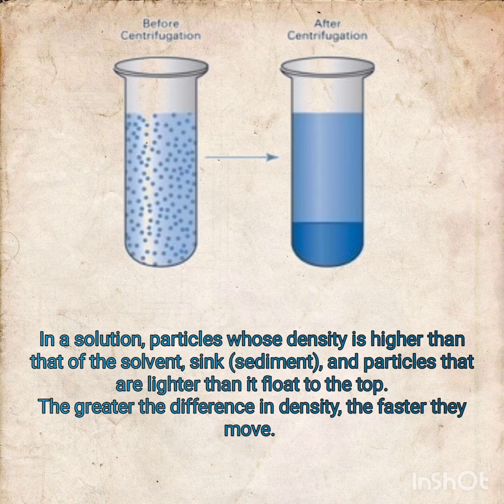The solution can be of any type here. The centrifugation technique is not specific to a solution, as centrifugation is about clearing out or cleaning out all the debris or suspended unwanted particles from a liquid.